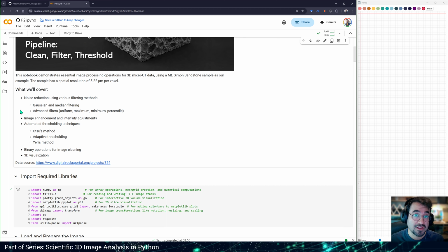Many filtering methods were developed initially for 2 dimensions, but not all of them can be applied in 3 dimensions, right? Or at least there are no straightforward packages and you need to write your own code to do so. So that's quite a space for improvement.